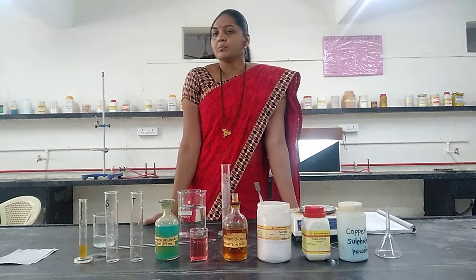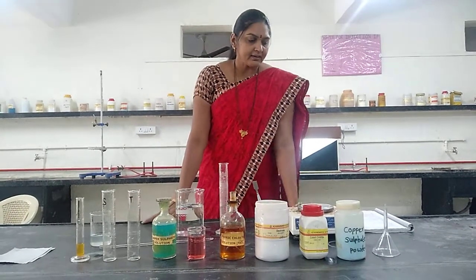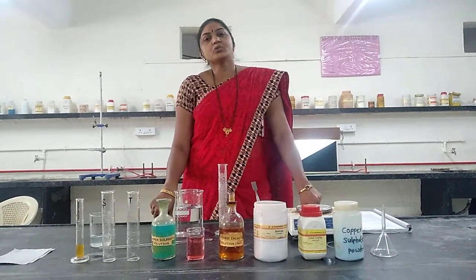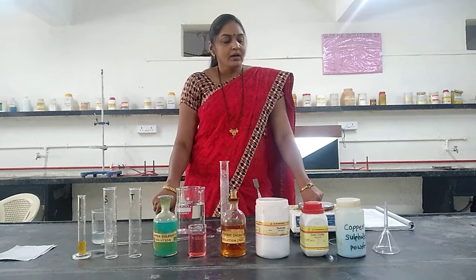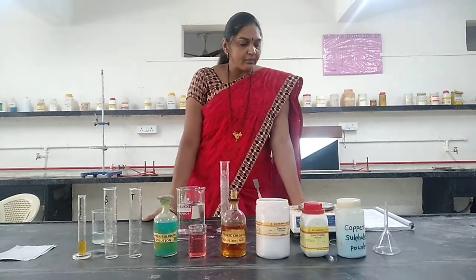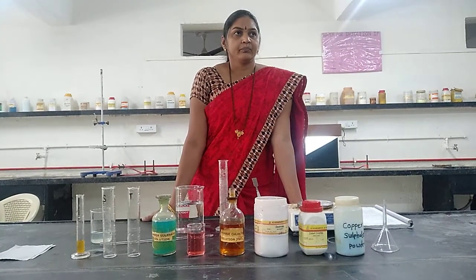Dextrose anhydrous, that is used for parenteral preparation. So two types of dextrose are there, dextrose monohydrate and dextrose anhydrous. So today we have to see suitability by colorimetric solution.